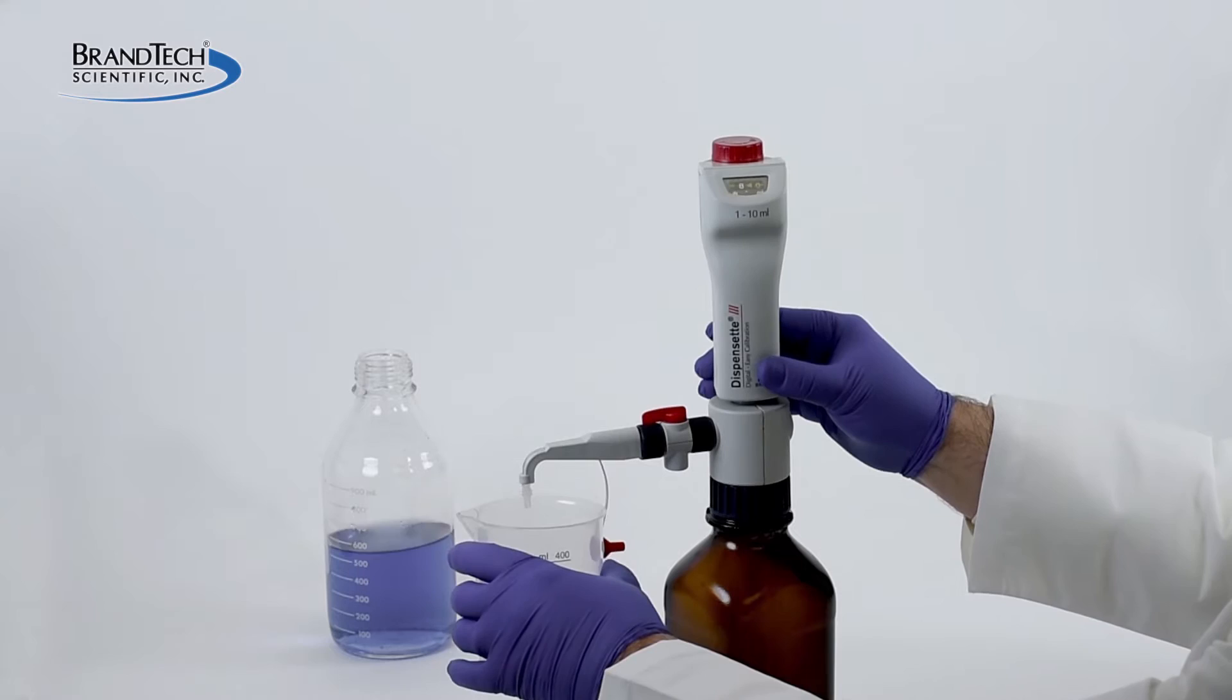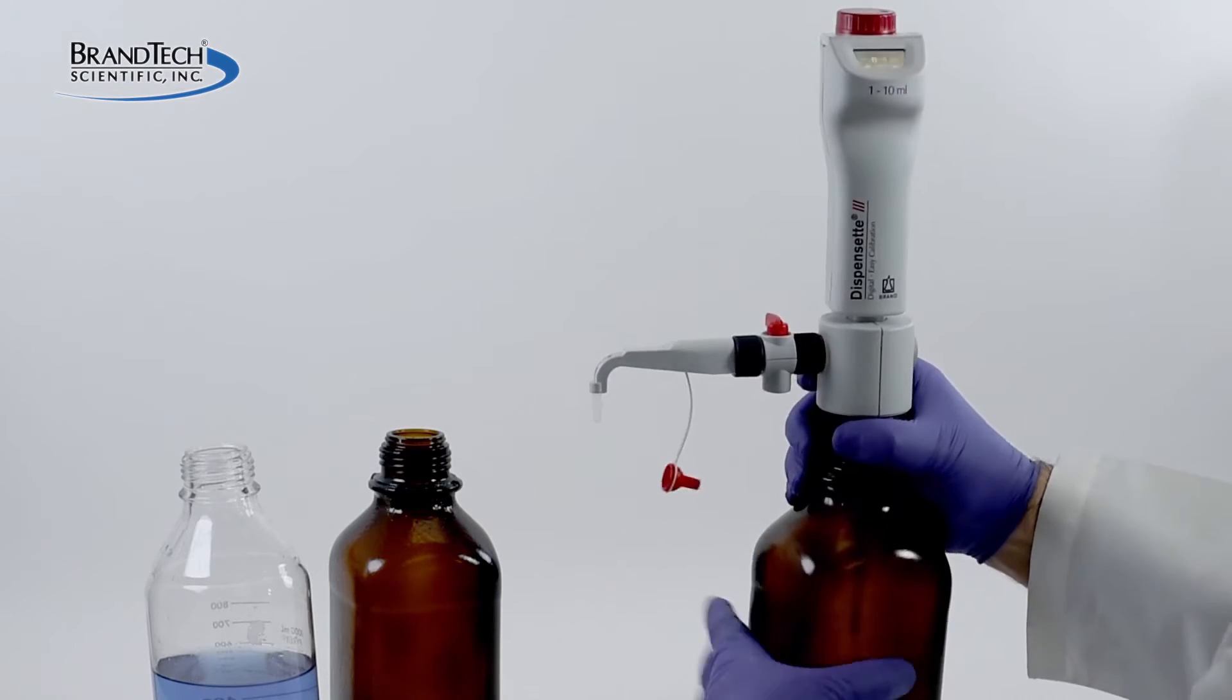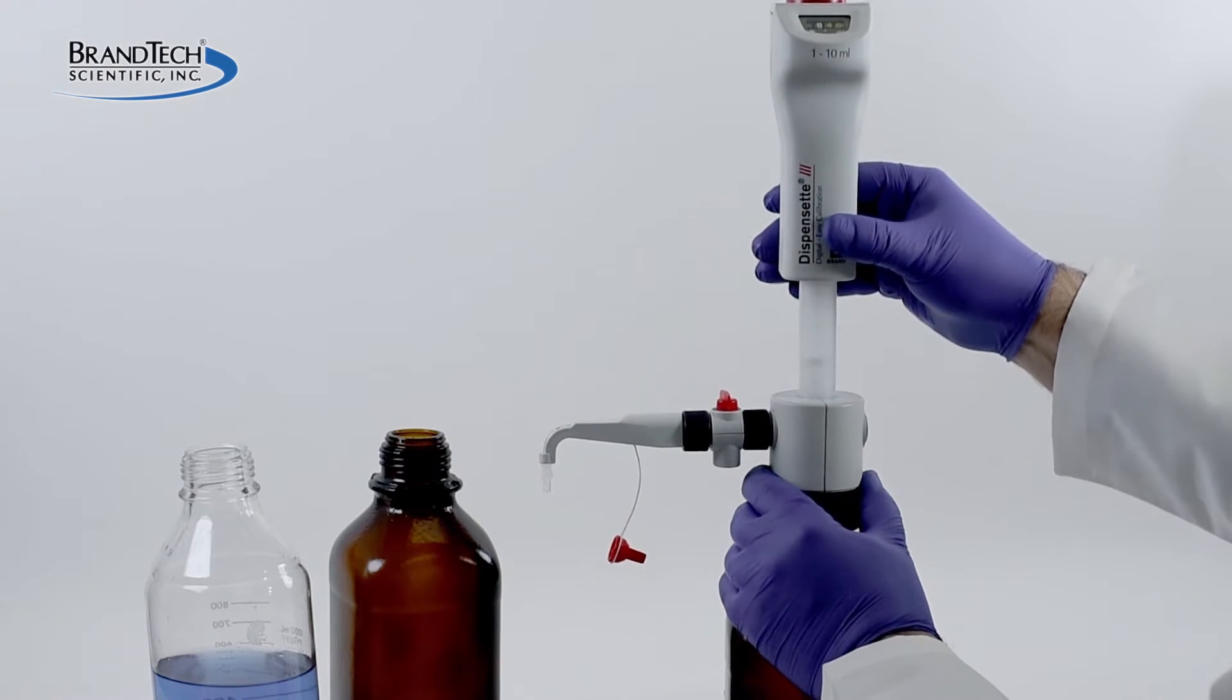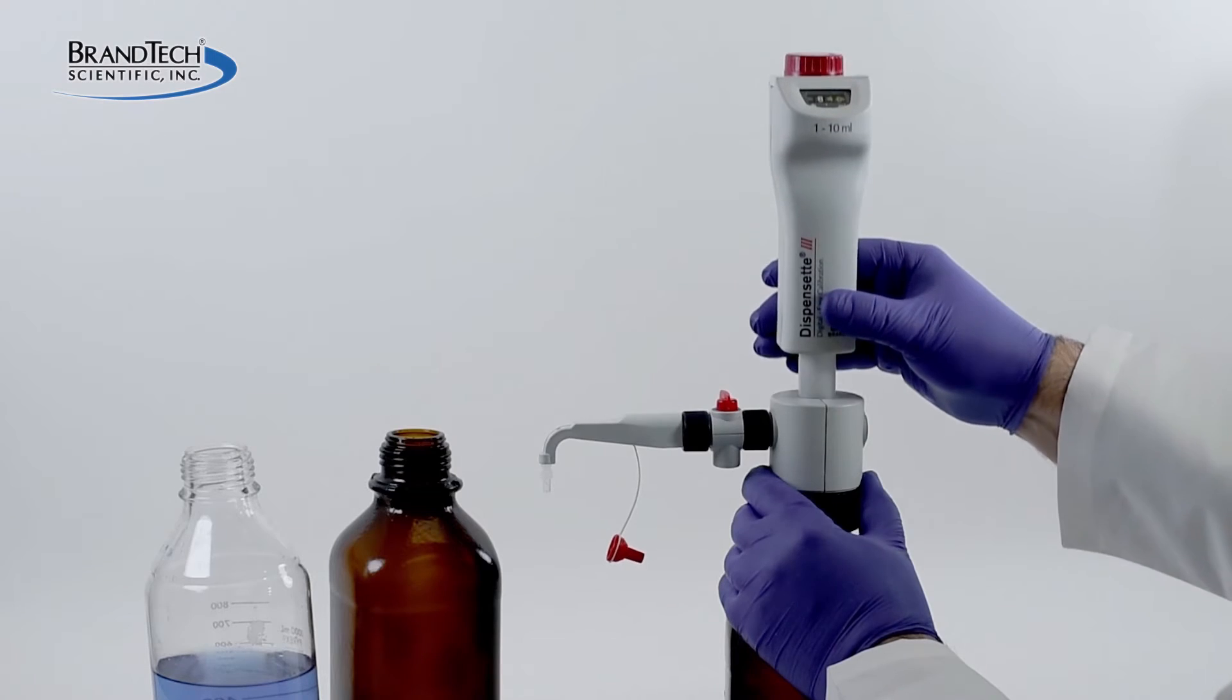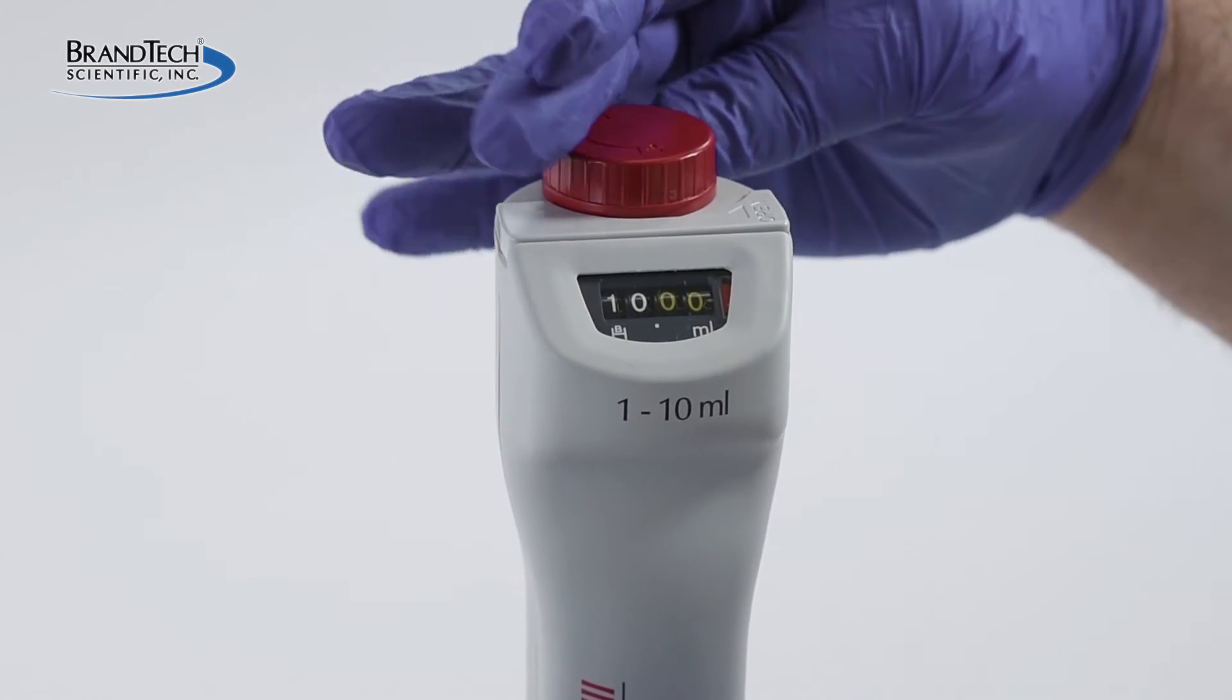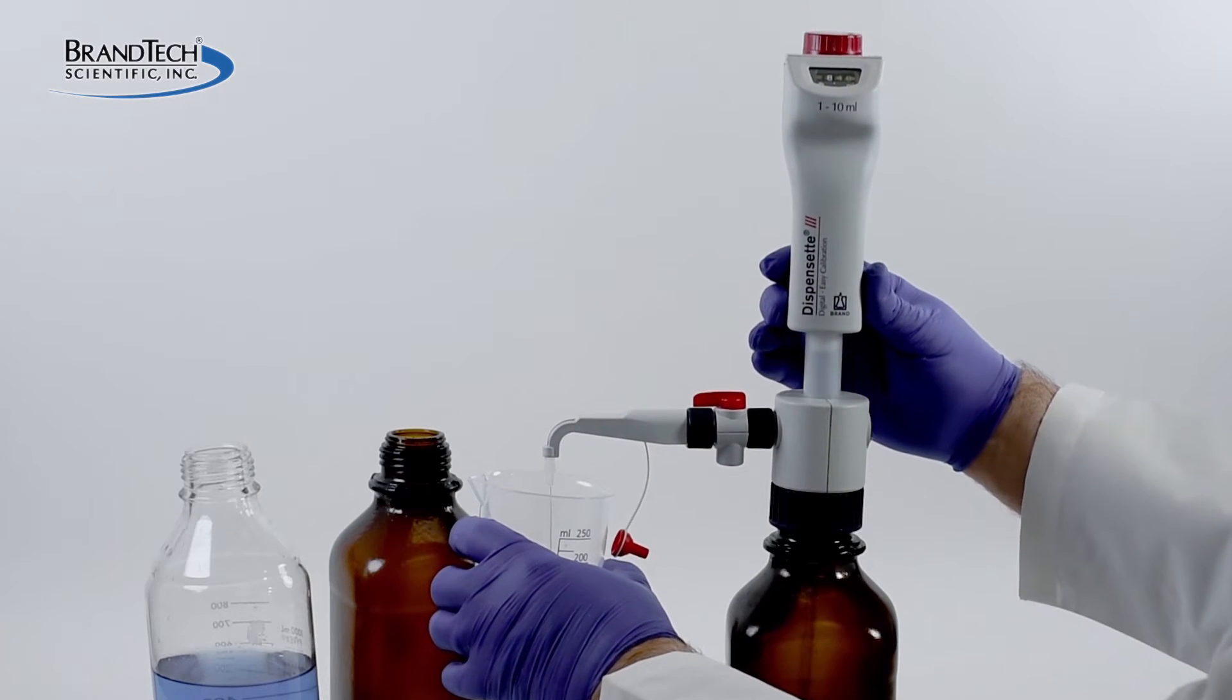Replace the filling tubes and attach the Dispenset to a bottle filled with the appropriate cleaning solution, for example, deionized water or an aqueous solution. Set the volume to nominal or maximum volume and dispense several times to purge remaining reagent.